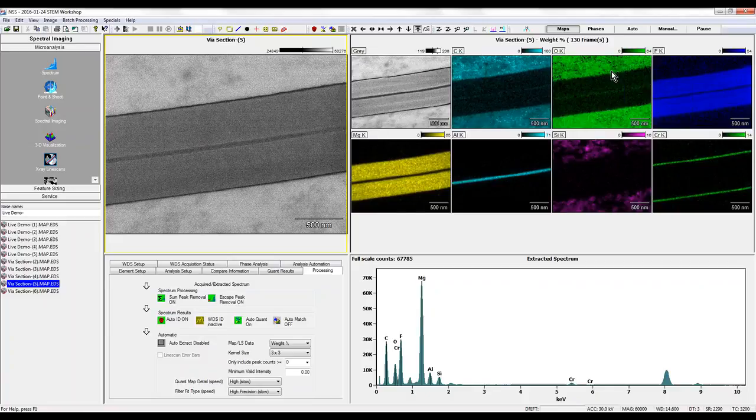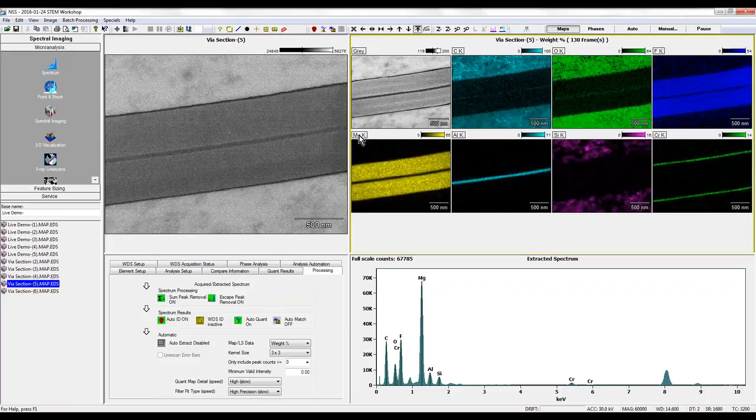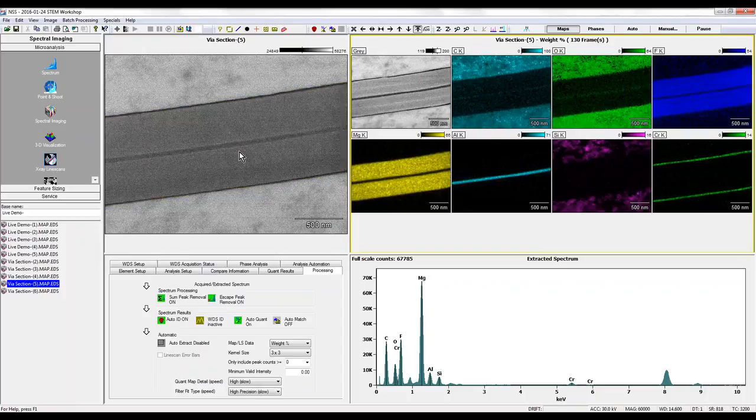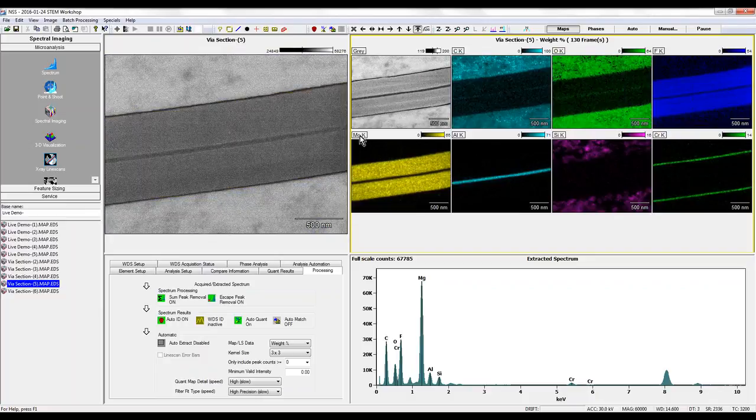So, what is this made out of? We see that we have fluorine, which takes up the bulk of those two thick layers across the middle of the crystal. We also have magnesium, which has a very strong signature across both of those middle stripes. Now, magnesium fluoride is a very, very common optical coating, and so it's not really a surprise that it makes an appearance here because its index of refraction and dispersion properties are going to be well known, and so it's going to be used in a lot of different applications such as this.